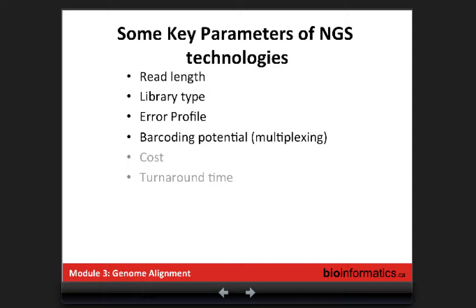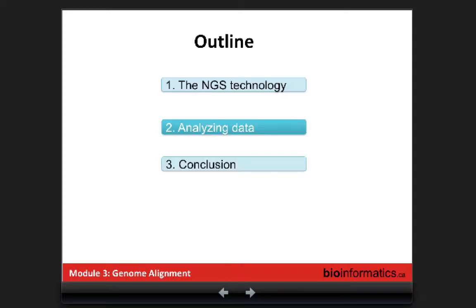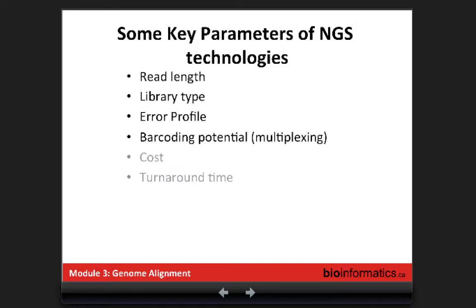So this is the main characteristic that needs to drive your choice. When I meet people and discuss with them, they usually come with these two parameters as a major factor. To my point of view, it will not be the best way to design your experiment. But for sure, we do not have unlimited funds, so we still need to take it into account.